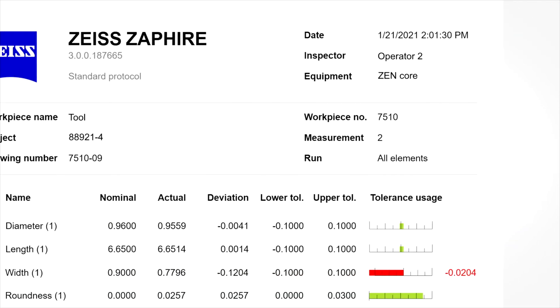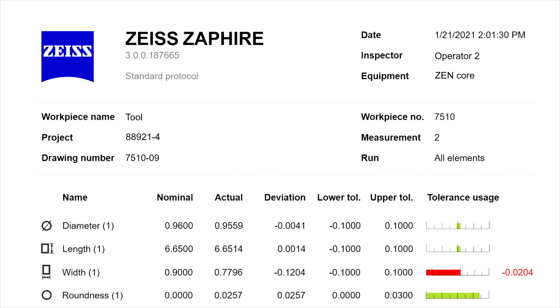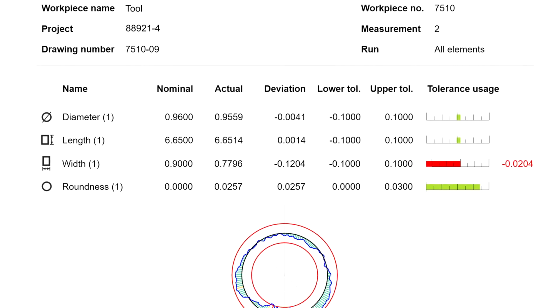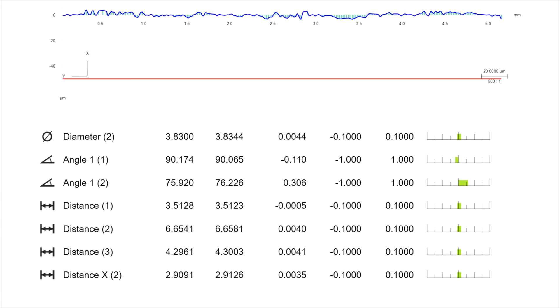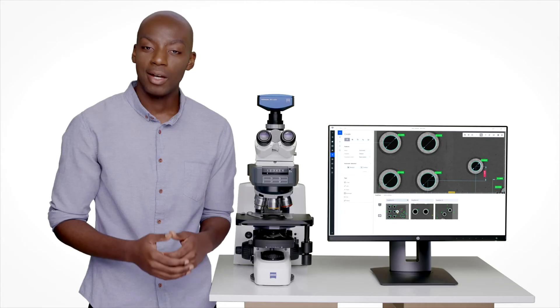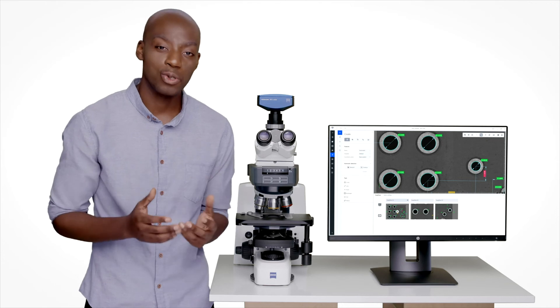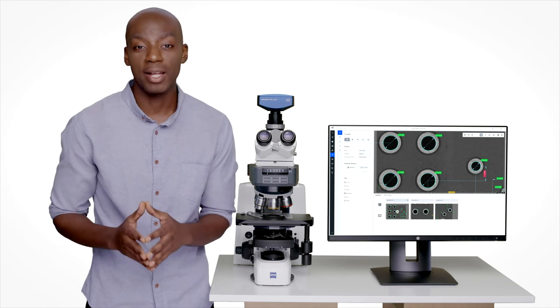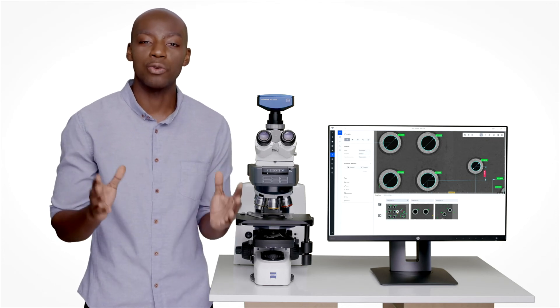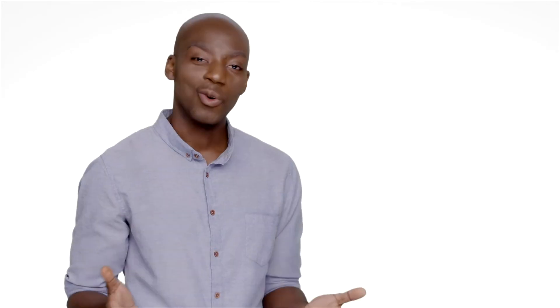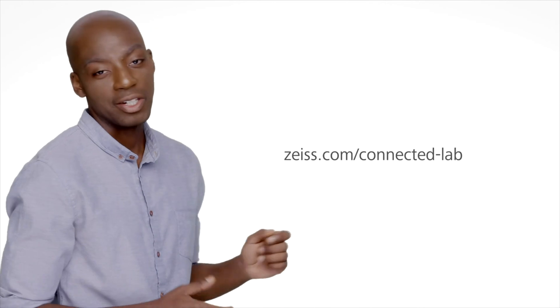Reports and statistics are generated automatically with Zeiss PiWeb. You can even export and upload the data for further analysis. And of course you can share inspection plans and results with colleagues in other labs all over the world. Want to learn more about software solutions for industrial quality applications? Check out our other videos.